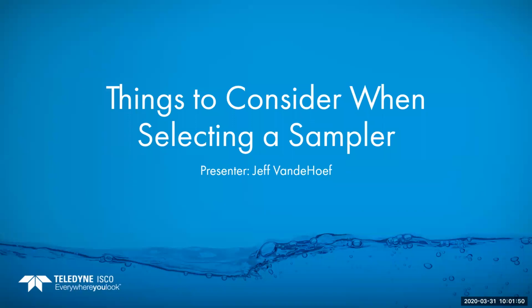Today's webinar is going to be over sampler selections, basically different types of samplers out there on the market, and things you need to consider when you're actually selecting a sampler, as far as power, site conditions, options you need, that kind of stuff. We will get going here.